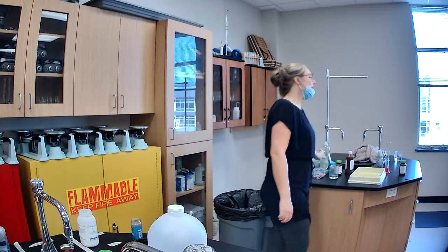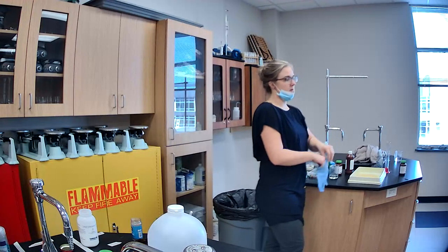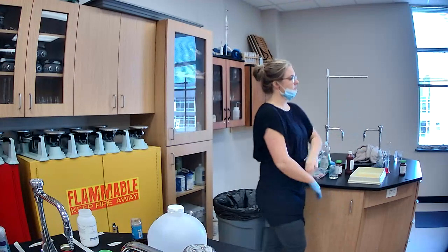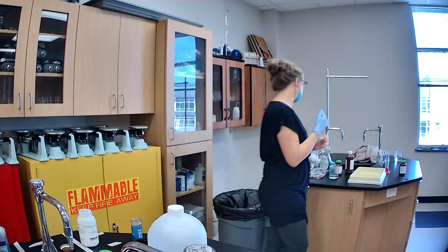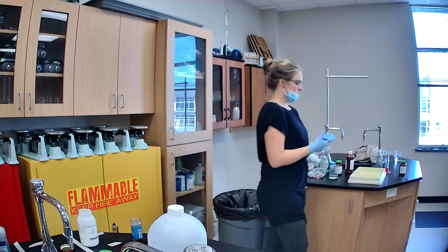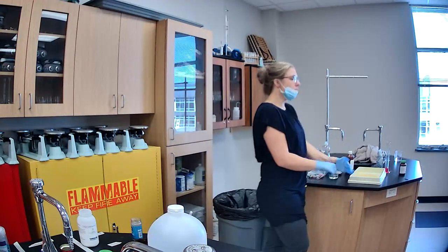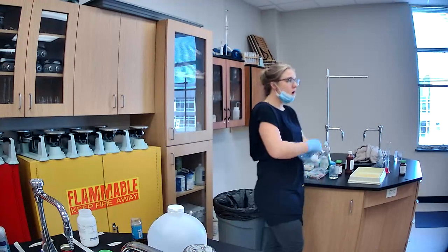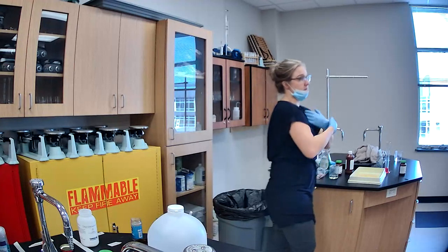But because it's 30%, I'm going to wear gloves. Why? Because, well, one, it's a chemical reaction, you don't want to burn yourself. And two, it might overflow. It's so much stronger than regular hydrogen peroxide, and I don't want my hand to burn.